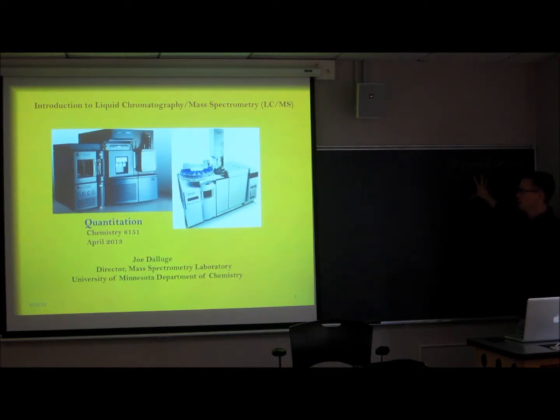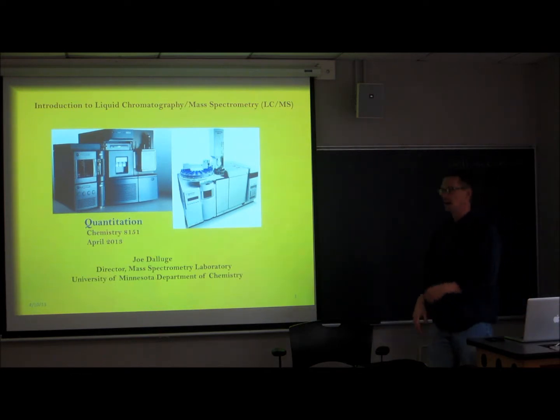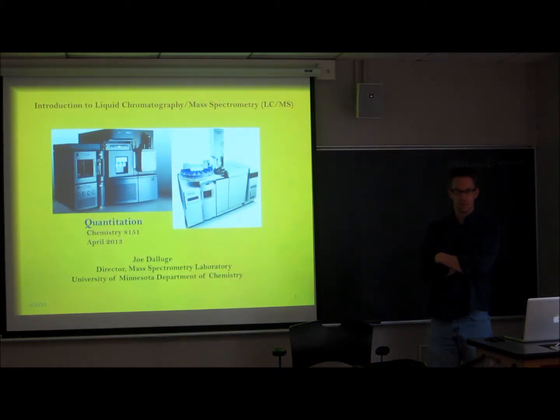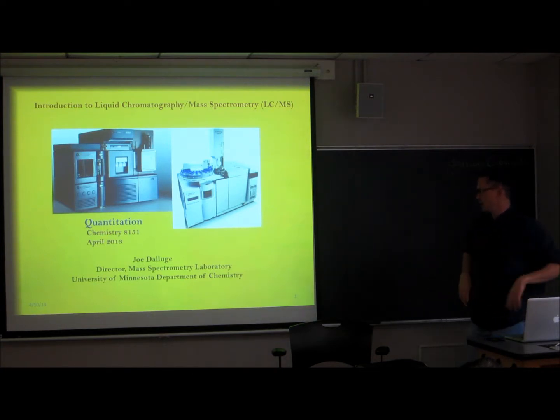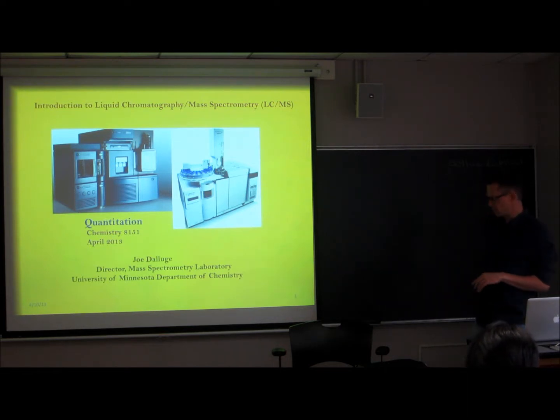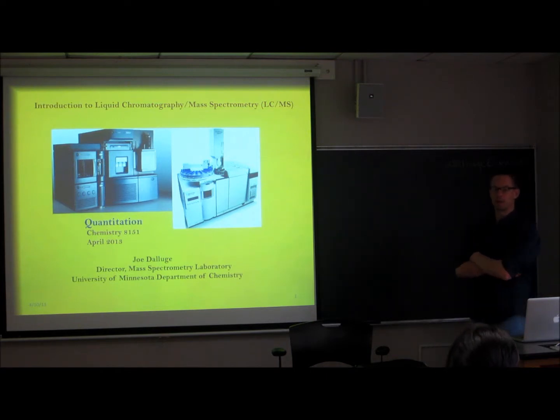So Monday, just to review a little bit, we talked about mass spectrometry as a general overview, and its coupling to liquid chromatography and chromatographic interfaces. And as an introduction, I gave you an overview of different mass spec sources, what types of ionization sources there are, what types of mass analyzers there are, and what their strengths and weaknesses are, specifically from the standpoint of coupling to liquid chromatography and doing quantitation.